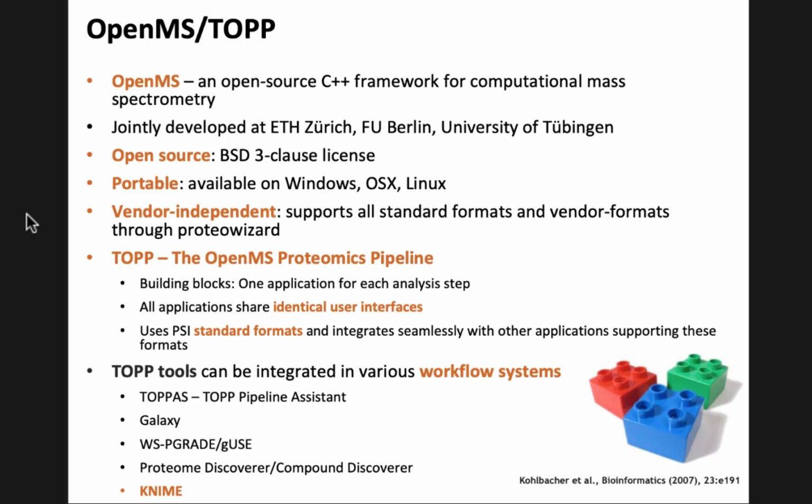It's parallel. It's a software library, so you can write code using OpenMS, but it's also a collection of tools, what we call TOPP, the OpenMS proteomics pipeline. And you have these Lego building blocks on the right-hand side of the slide. That's the fundamental idea. Lego blocks are so fun because you can build so many different things out of them. So rather than having one tool where you have an interface and you click and it all works, with OpenMS you have lots of building blocks, and it's up to you to build something useful out of them or fun. So the idea is to have these fundamental building blocks for each analysis step.